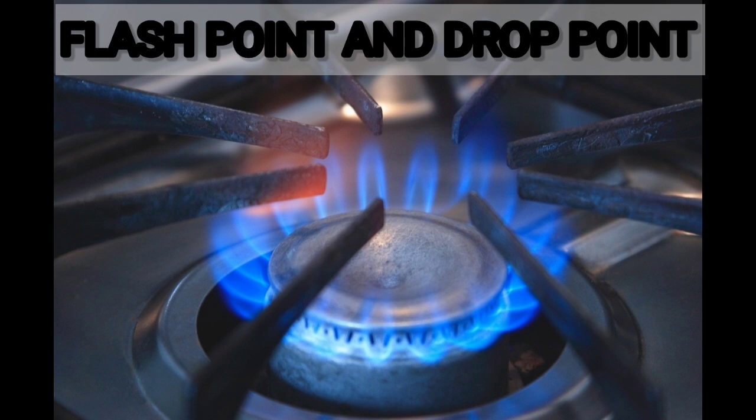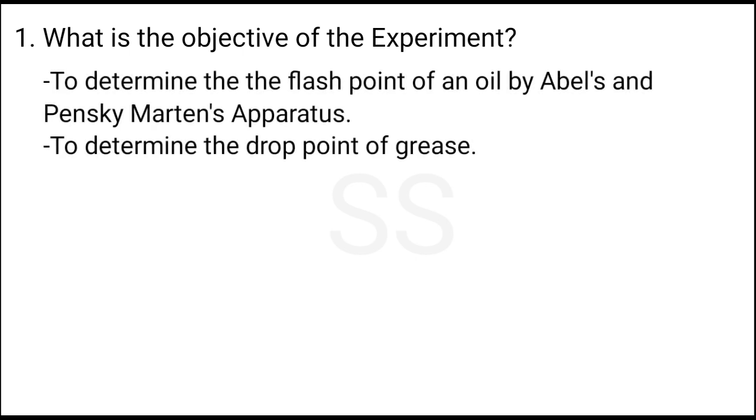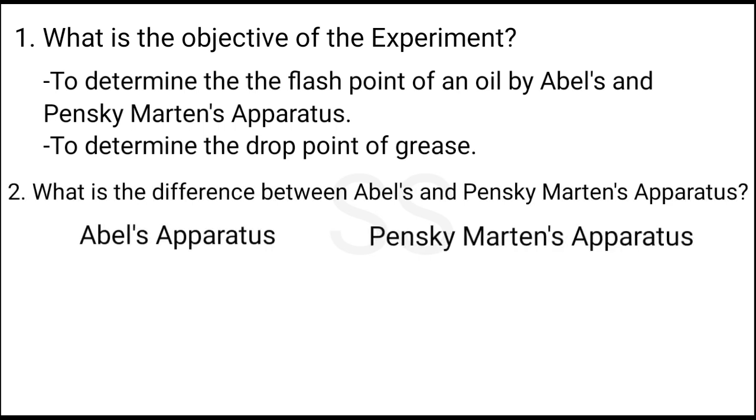So let's get started. Firstly, what is the objective of this experiment? The objective of this experiment is to determine the flashpoint of an oil by Abel's and Pensky-Martens apparatus, and to determine the drop point of grease. What is the difference between Abel's and Pensky-Martens apparatus?